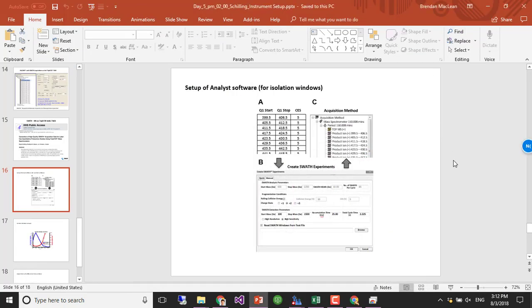Once you've generated this Excel file, and again, the protocol paper details this out, then it goes into a template. Oh, wow, this is really bad to see. I can't even read it when I stand right in front of it. I'm sorry. It's also not in presenter mode.